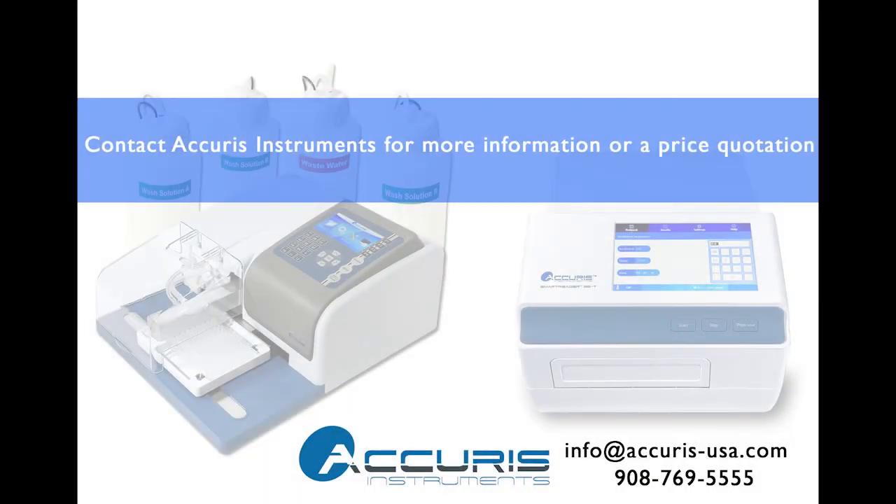Acuris Instruments offers a full line of microplate equipment. For additional info or a price quote on our SmartWasher 96 or any of our microplate instruments, please contact us today.